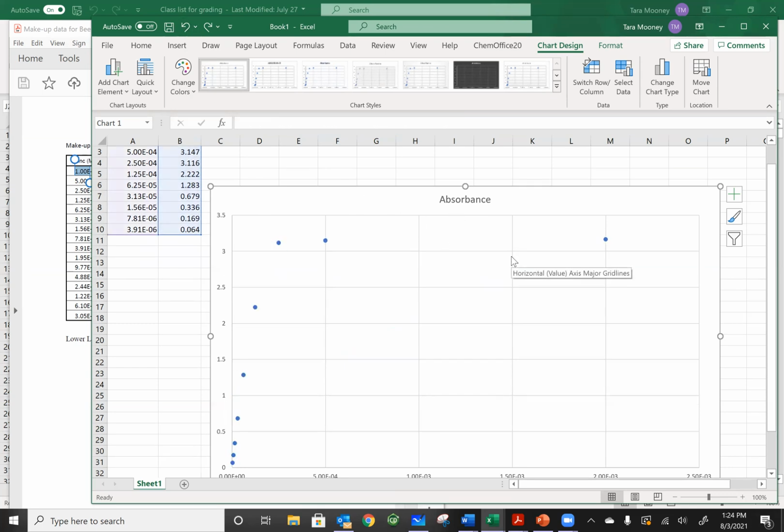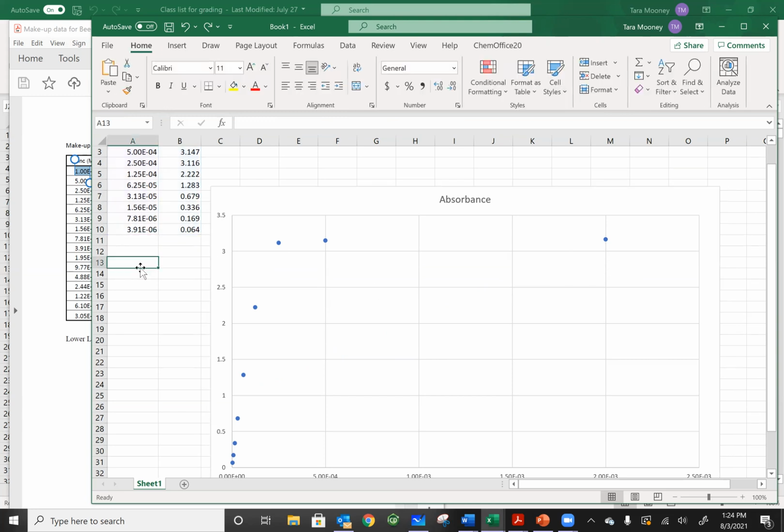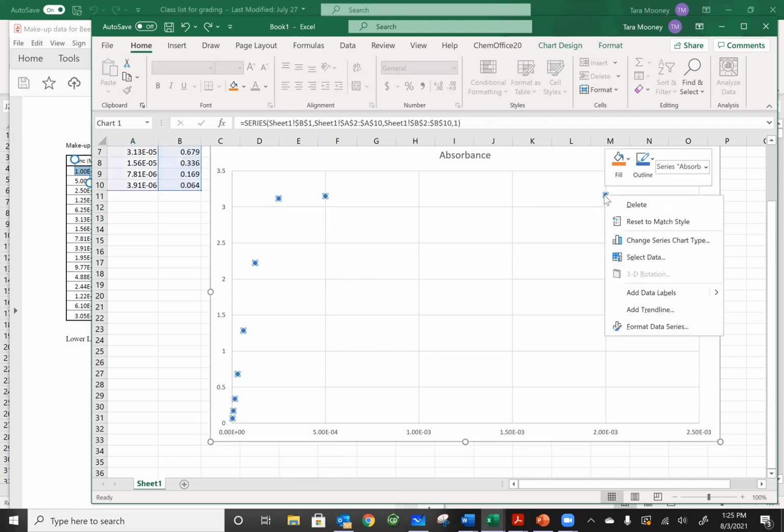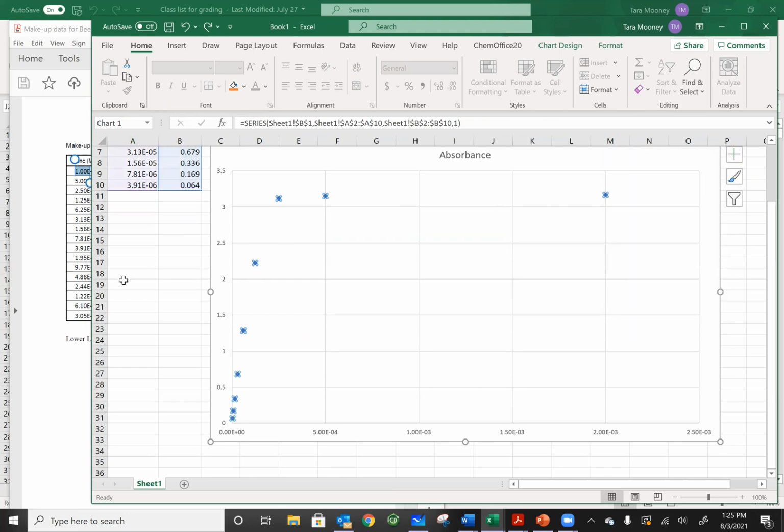So we are going to want to plot only the data that we see that is linear. I believe that this data point, 2.5 at 0.25 millimolar, doesn't really look linear. So we can delete these 3 data points because they are not linear, so we don't need them.